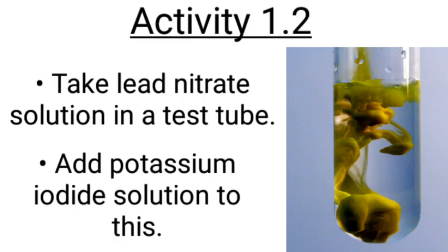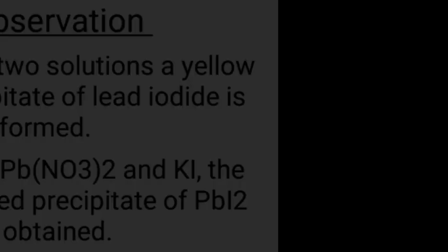Activity 1.2. Take lead nitrate solution in a test tube. Add potassium iodide solution to this.